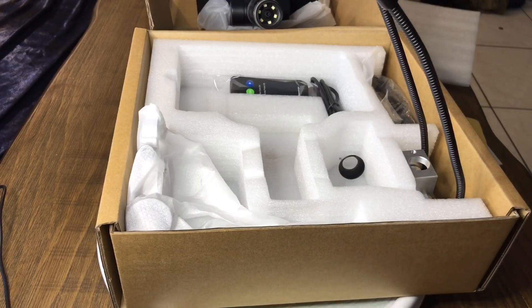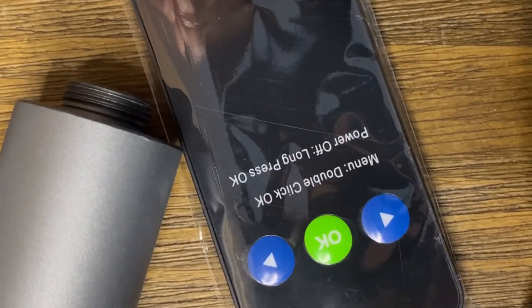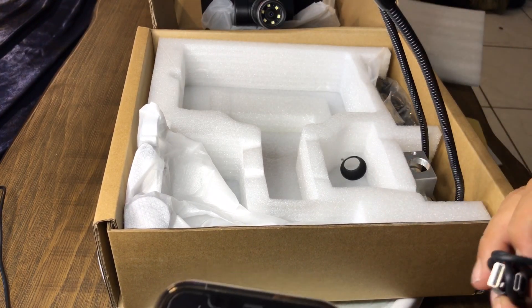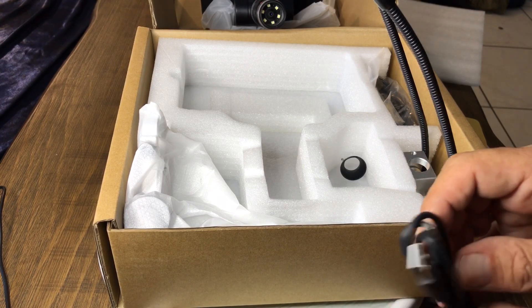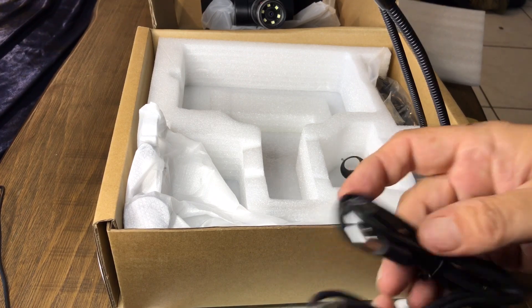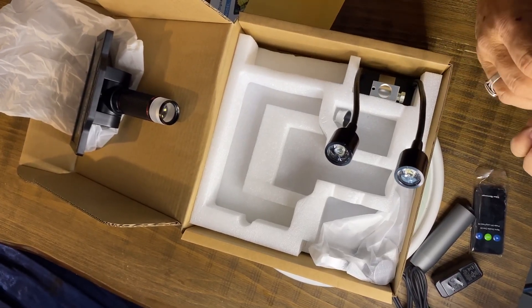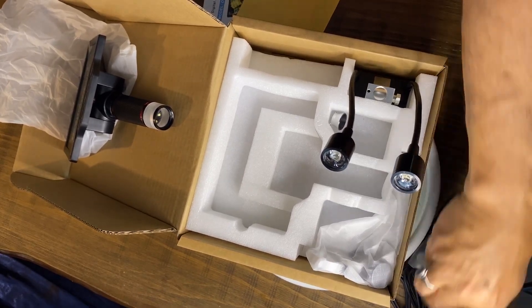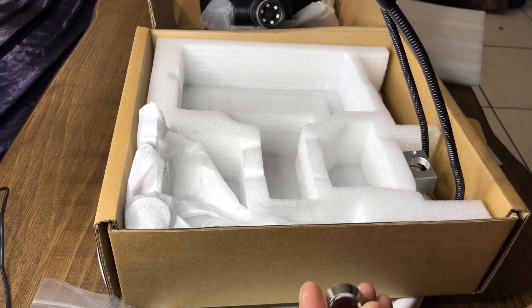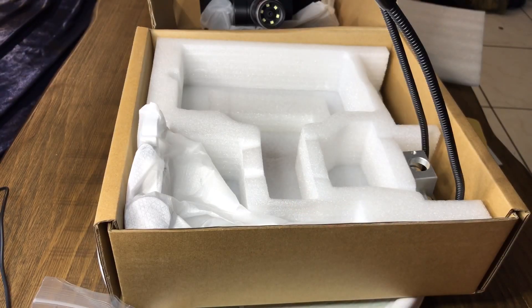It comes with a charging cable to go with the little charging brick. We've got a remote control — double-click menus. It's a video microscope with a remote control, which is nice. We've also got a USB-C charger, so two different charging cables, both USB-C. I'm not sure why it included two cables — maybe one is for video. And here's a third cable: there's your actual video cable. There's also something else here — maybe a light collector of some sort.